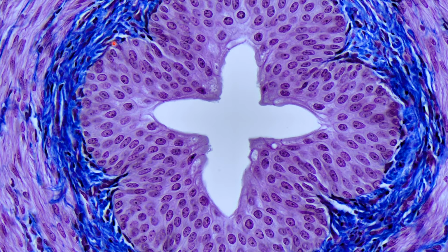Name this tissue from here to here. So there is our basement membrane.